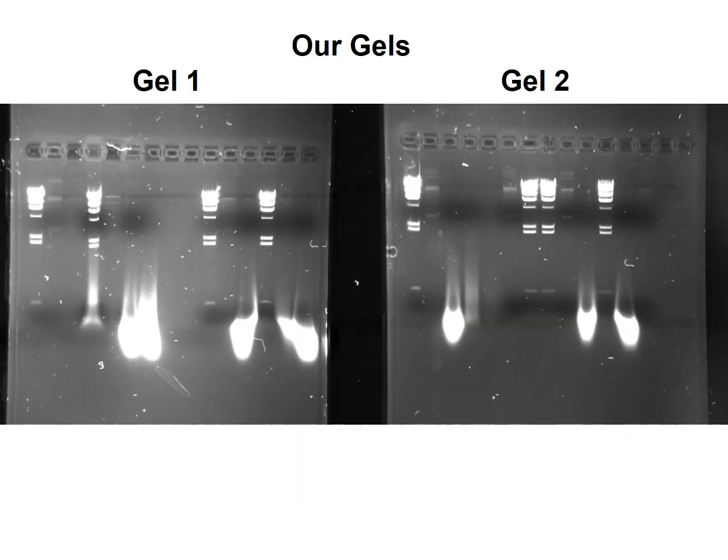So here are our gels — gel one and gel two. I have the labels, and you can download those from the class Moodle site. Congratulations — these are some of the best gels I've seen in a long time in this class. I think everybody's samples showed up here, which is also good. Sometimes people's samples don't show up, and these ones are looking absolutely fantastic.